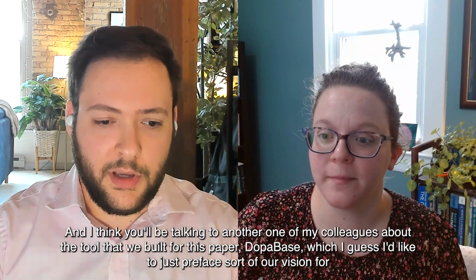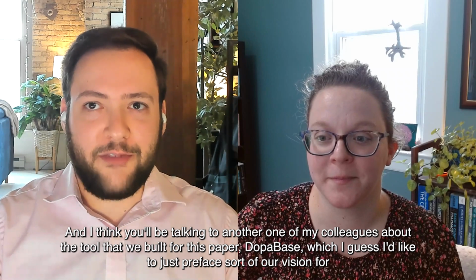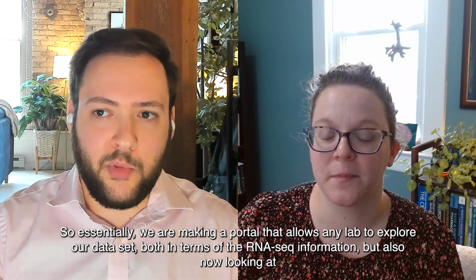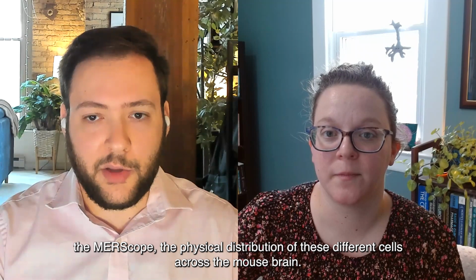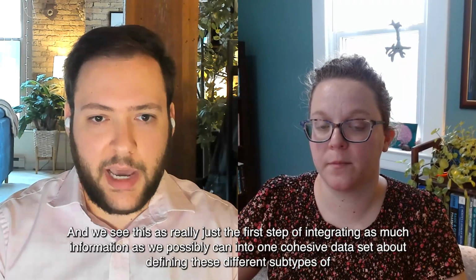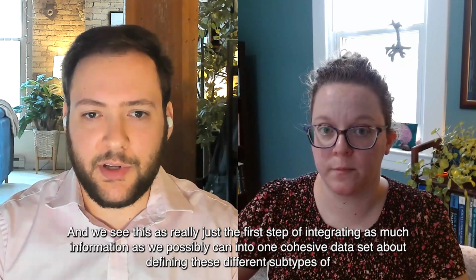Sure. And I think you'll be talking to another one of my colleagues about the tool that we built for this paper, DopaBase, which I'd like to just preface with our vision for this, where it's going in the years to come. Essentially, we are making a portal that allows any lab to explore our data set, both in terms of the RNA-seq information, but also now looking at the MERSCOPE, the physical distribution of these different cells across the mouse brain. And we see this as really just the first step of integrating as much information as we possibly can into one cohesive data set about defining these different subtypes of dopamine neurons.